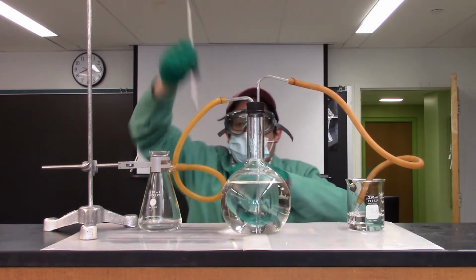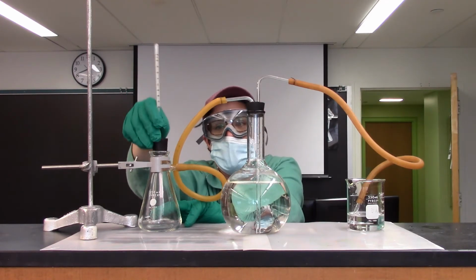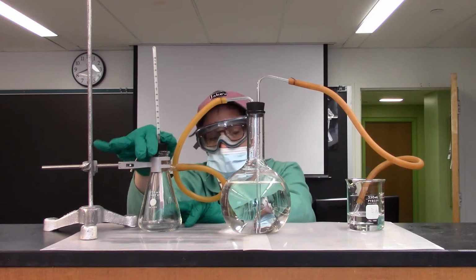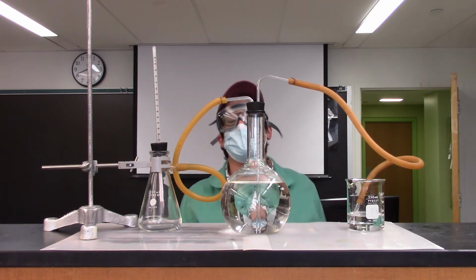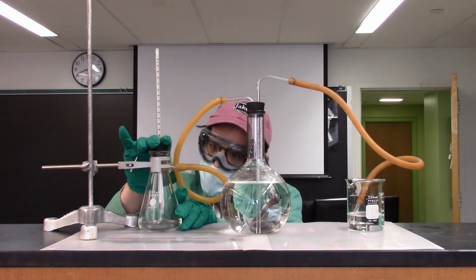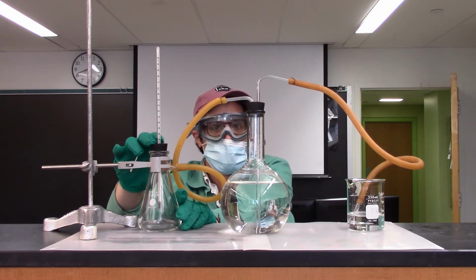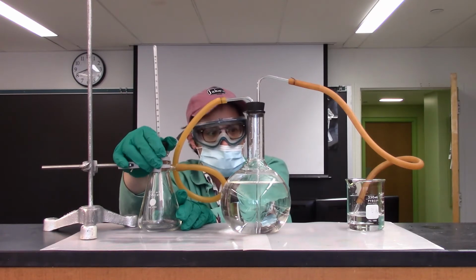So when we start the reaction, we have our 25 milliliters of hydrochloric acid and our metal. We're going to be putting in a thermometer because, as we know, with the equation we'll be using, temperature is crucial for taking all this into account. So this is just a regular thermometer plugged in a single hole stopper for the top there.